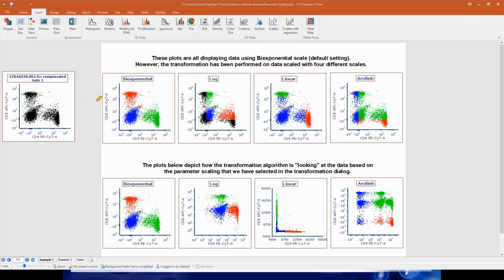I just want to tell you that it's a clustering, that this is my file, and that I've asked the software to cluster those cells in 3 groups. So basically, I would like to end up with group 1, group 2, and group 3. So this is what I'm expecting.